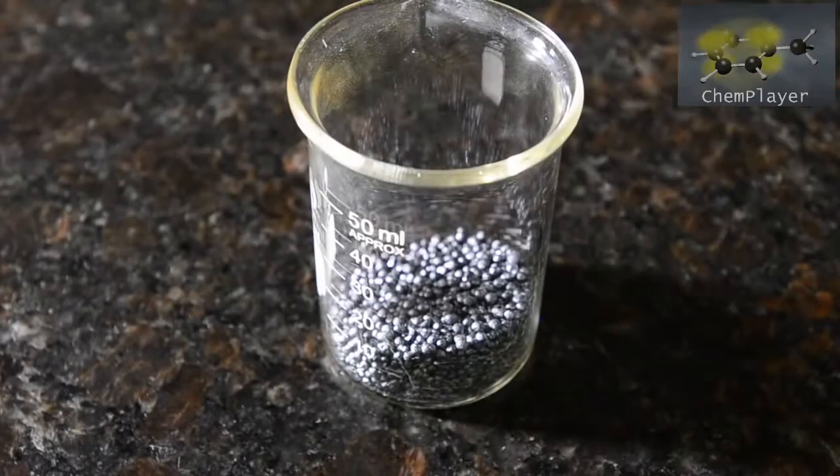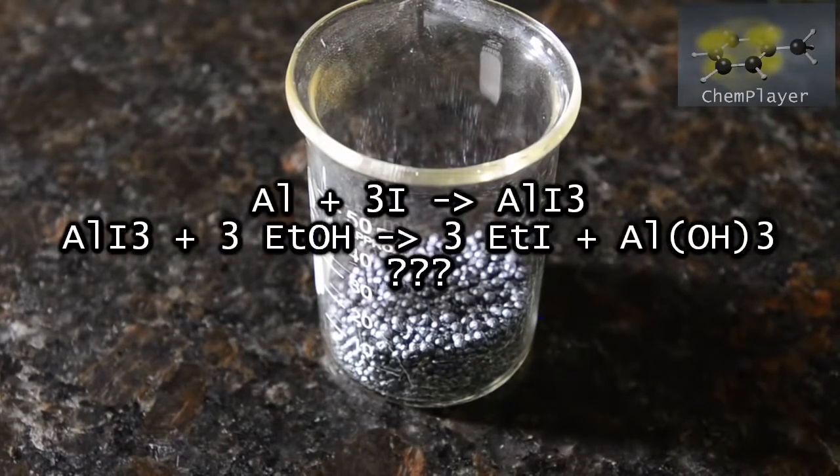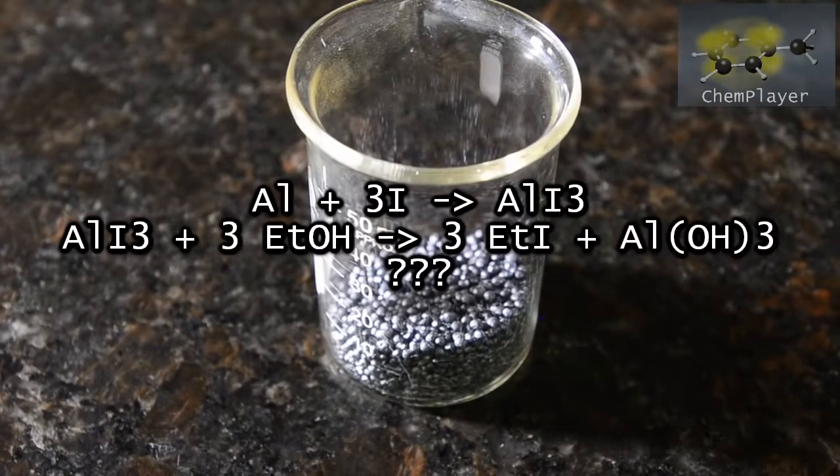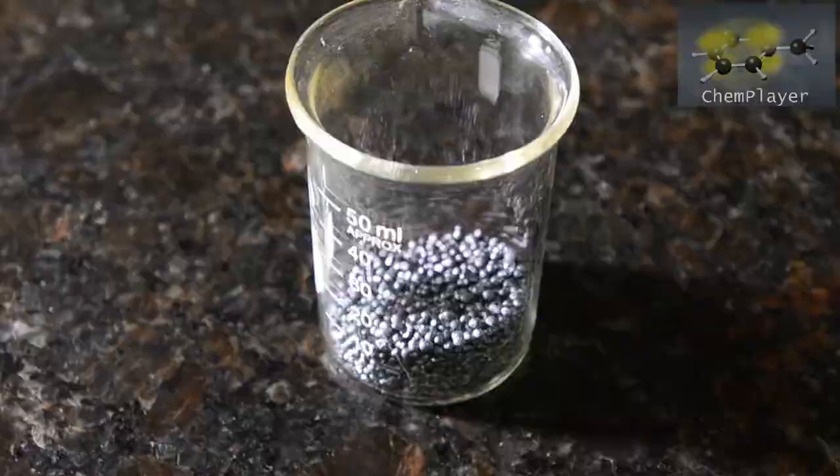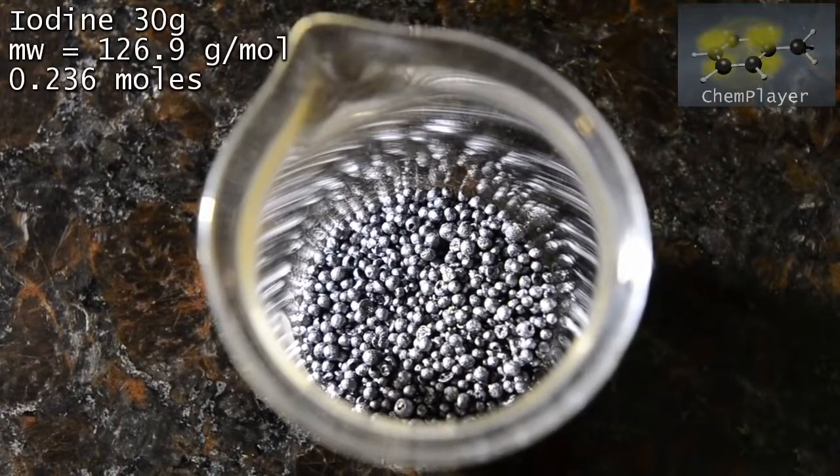In this video we're going to try out an unusual preparation of ethyl iodide. The classic preparation covered in our other video uses iodine and red phosphorus, but we heard that it was also possible using iodine and aluminum metal.